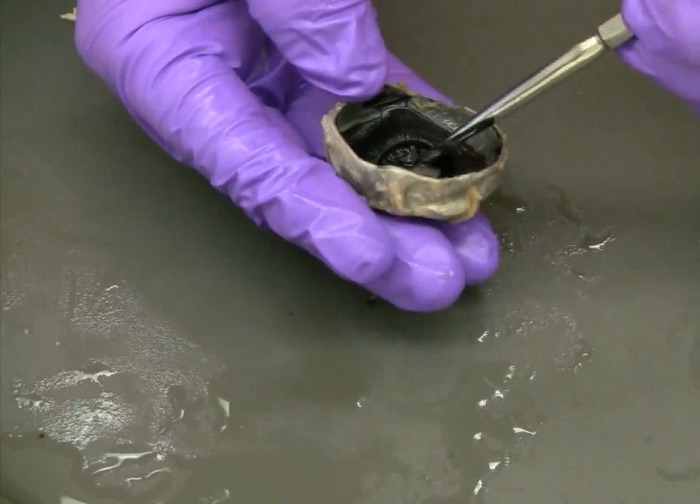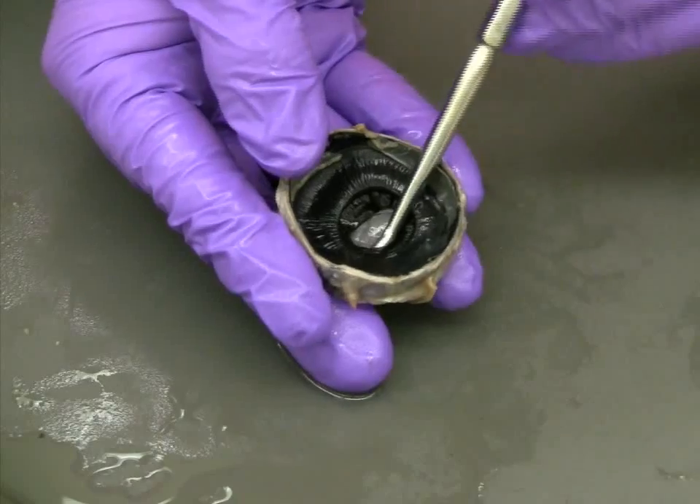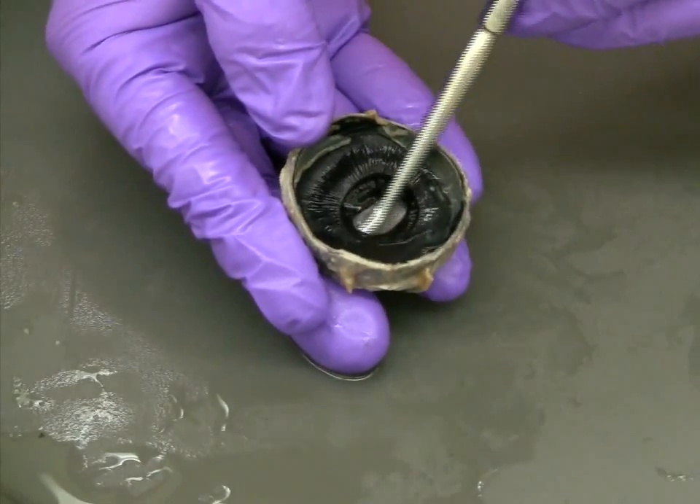In order to get a closer look at the structure of the iris, using your blunt probe, you can begin to loosen it from the surrounding tissue of the eye.